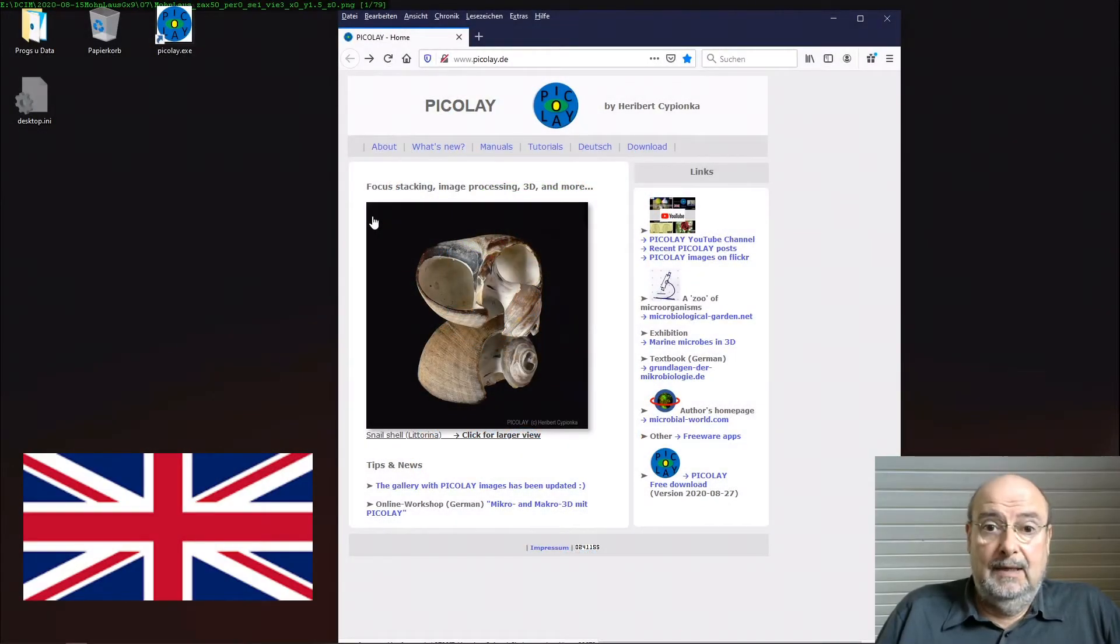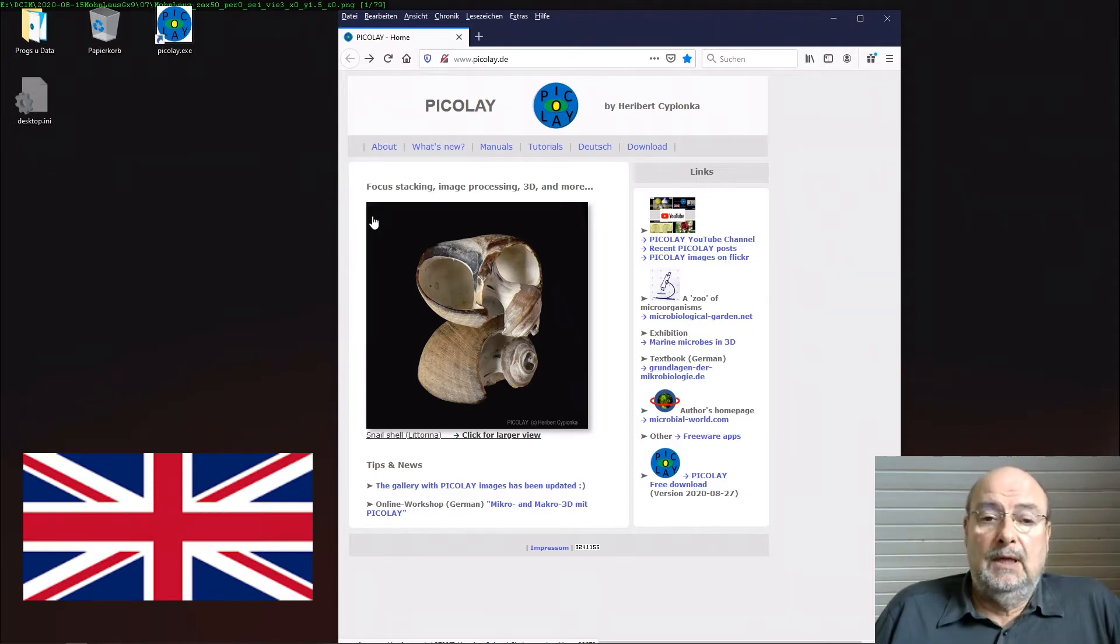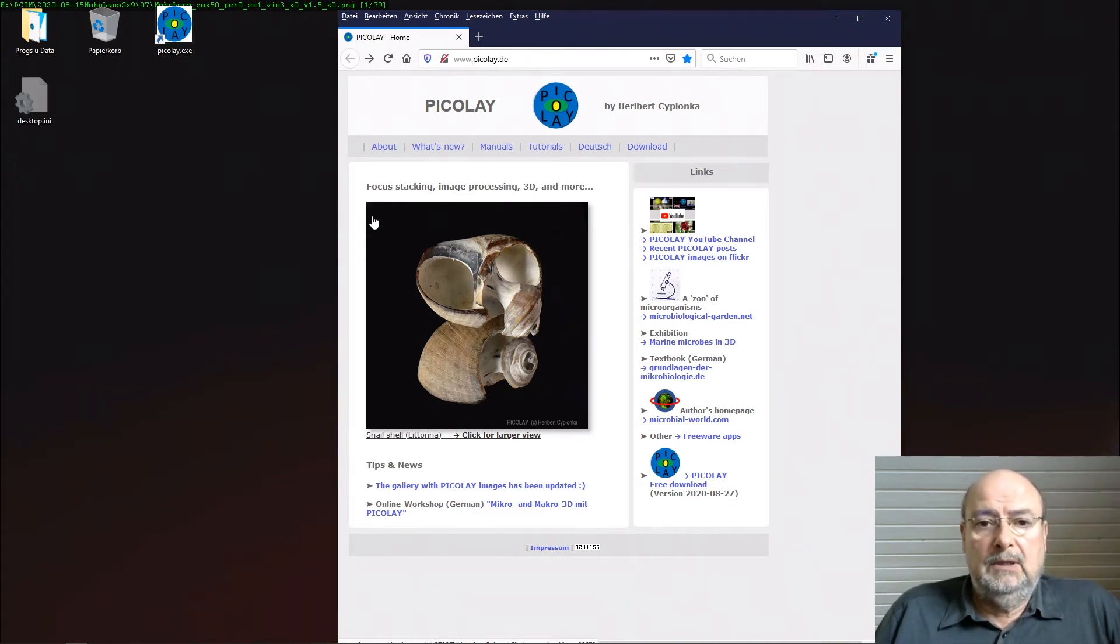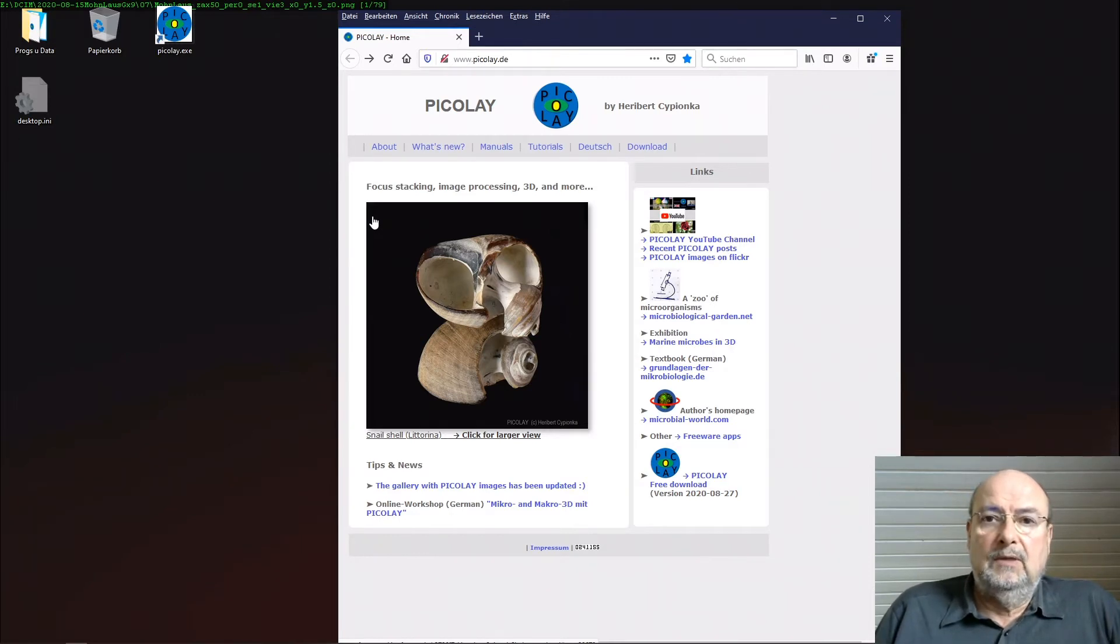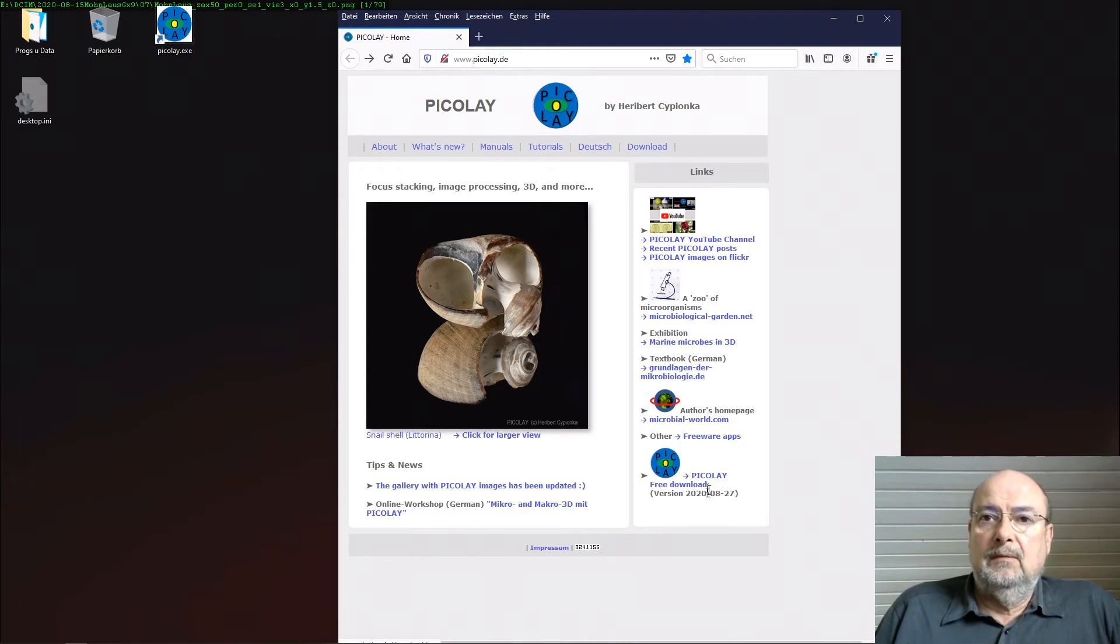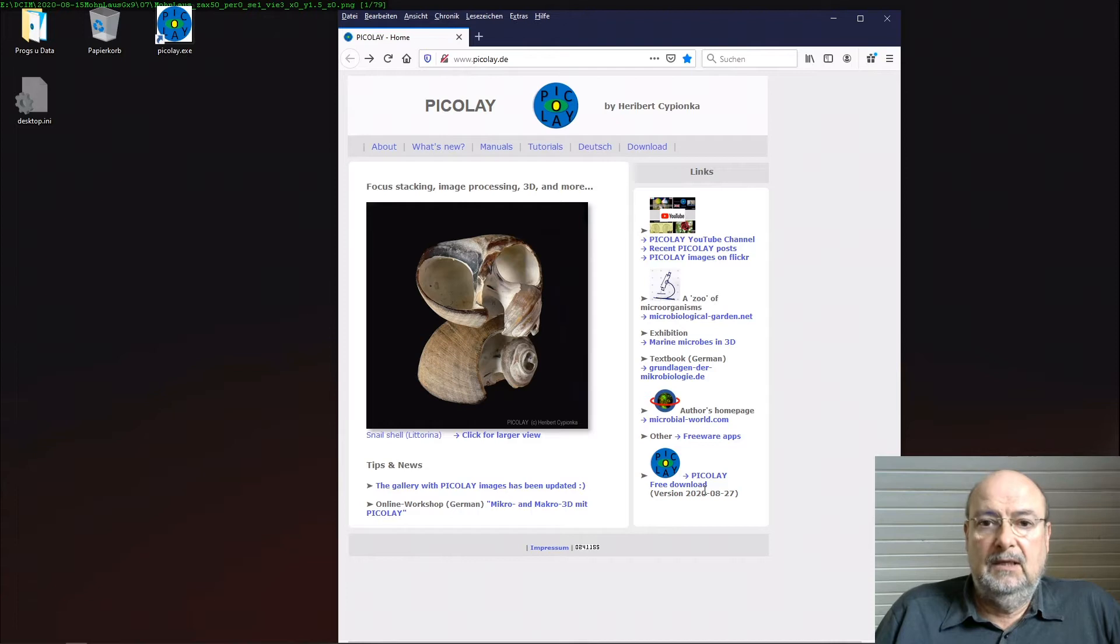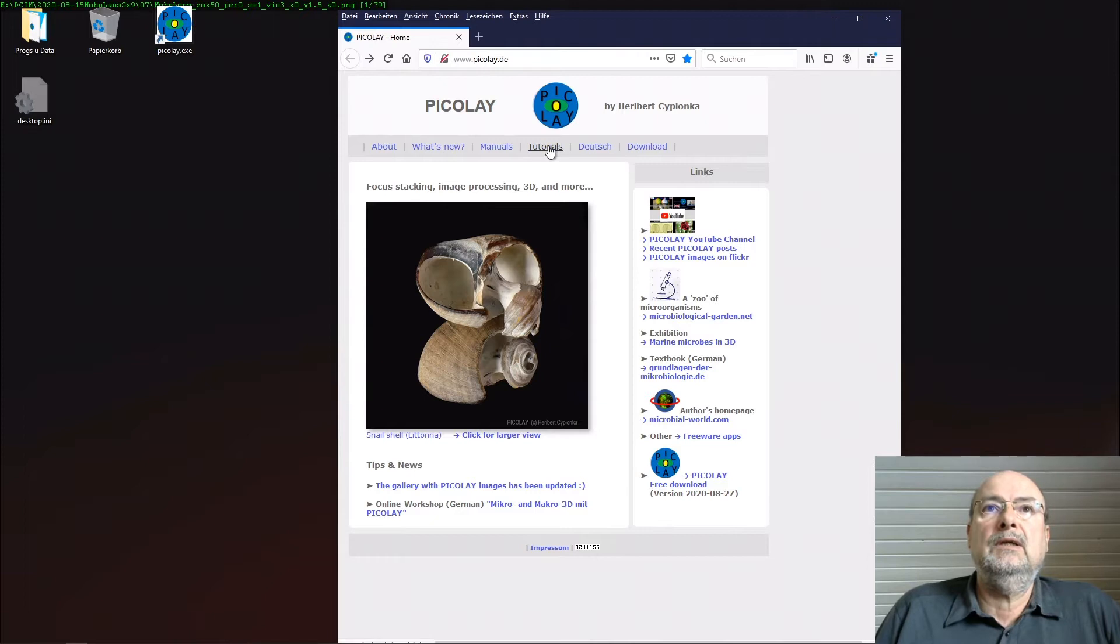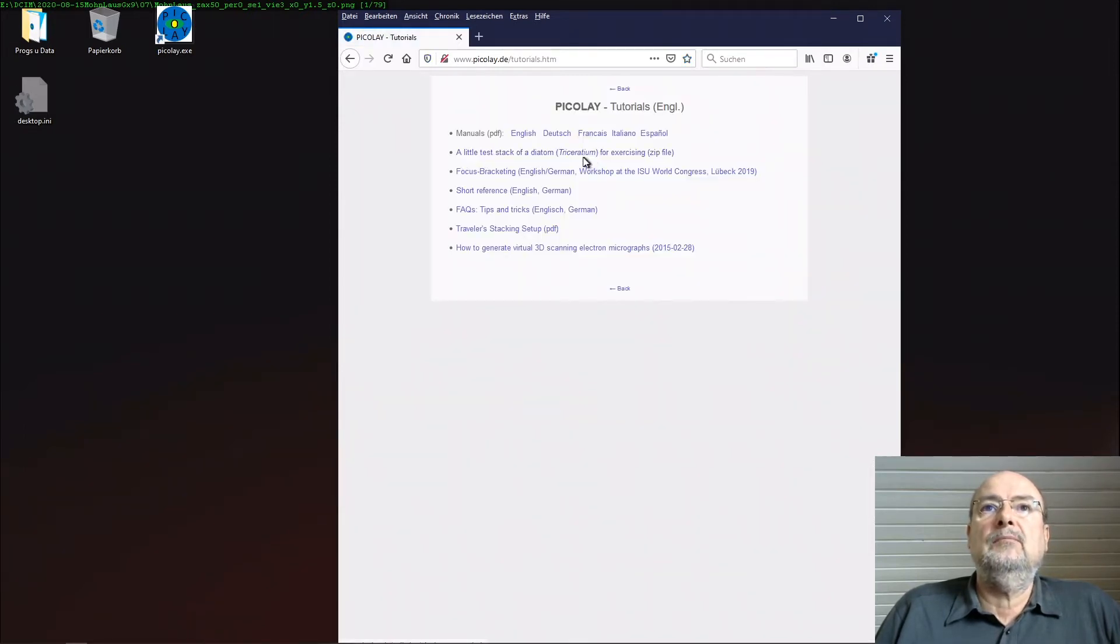Hi and welcome to the PICOLAY channel. Today I'd like to demonstrate focus stacking with PICOLAY using a little test stack that is freely available. If you download PICOLAY with the installer, you'll get this little stack, or you can find it on the PICOLAY homepage under tutorials - a little test stack of a diatom for exercising.